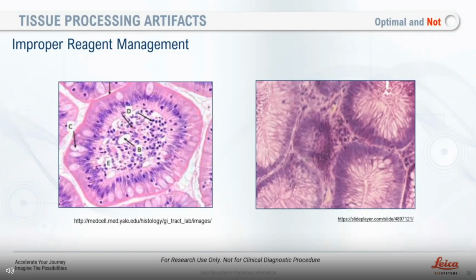Let me give you a little background on why we do warm water flushes, and it refers back to the slide we talked about with formalin salts. Through processing, as the tissue moves from the formalin to that first alcohol, if the concentration is a little too high, I think I mentioned 72, 73, it seems like that's when it begins, you're going to have those buffered salts coming out because of that acid-base reaction.